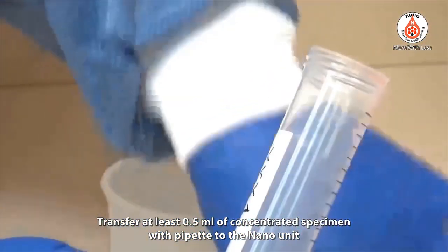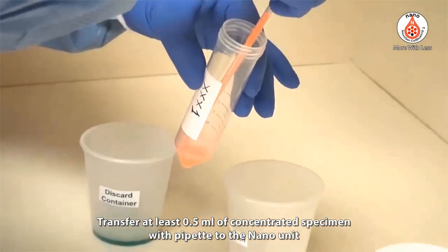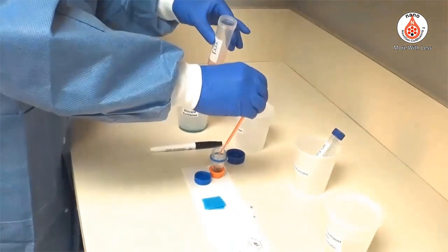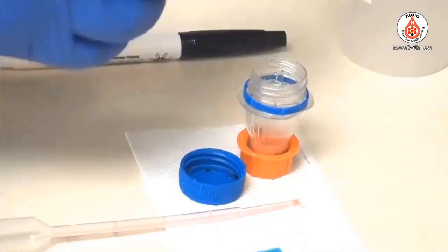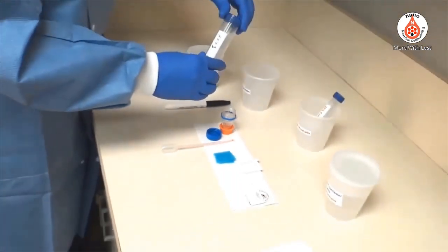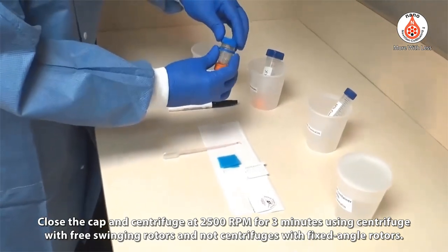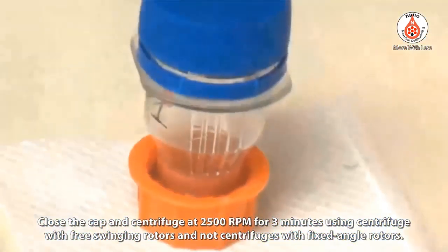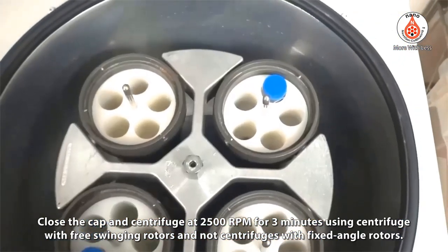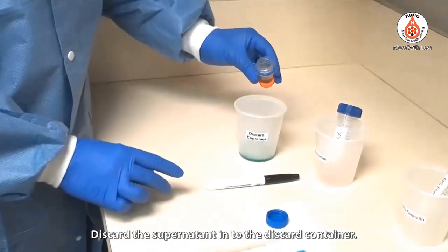Transfer at least 0.5 milliliters of concentrated specimen using a pipette into the Nano unit. Close the cap and centrifuge at 2500 RPM for 3 minutes using a centrifuge with free-swinging rotors — do not use centrifuges with fixed angle rotors. Discard the supernatant into the discard container.